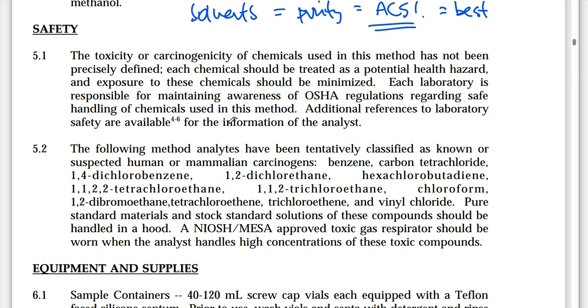But it says safety for this particular method. Number 1, the toxicity or carcinogenicity of chemicals used in this method has not been precisely defined. So you're going to do this, but guess what? We don't really know if it's really going to be cancer causing or not. Each chemical should be treated as a potential health hazard and minimize your exposure to them.